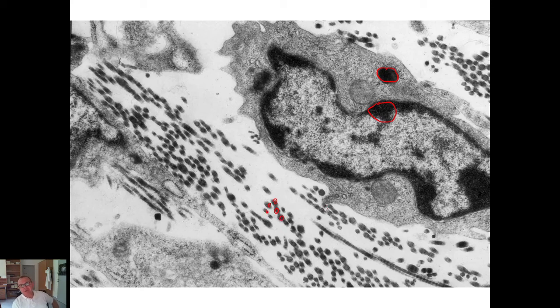And these parts, which are black, are called electron dense, and the structures which don't bind the heavy metals are white, like this extracellular matrix here, or some pieces of the nucleus, and they are called electron lucent in laboratory histological language.